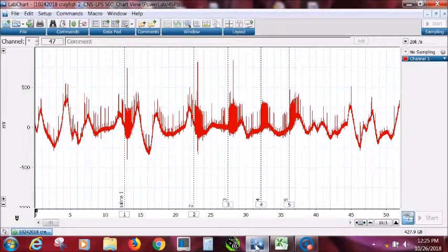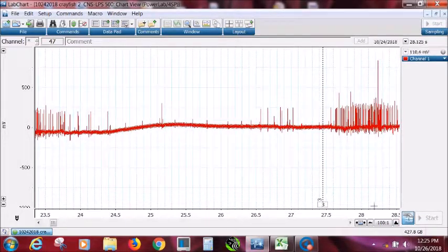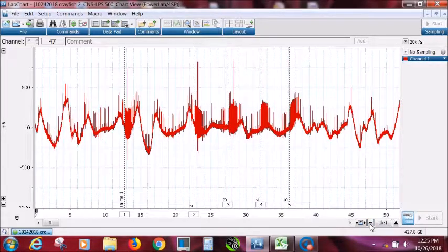What we're going to try to do here is show you how to analyze the frequency of these spikes, which we call extracellular recordings of action potential spikes. These are recordings from the third root with the suction electrode, and let's look over the file. Remember, you can pull your file up, and if you're already a little bit familiar with Chart, let me go through a few features that make it easier to look at your file. You can spread it out by clicking this little mountain down here, or you can condense it up by clicking that way.